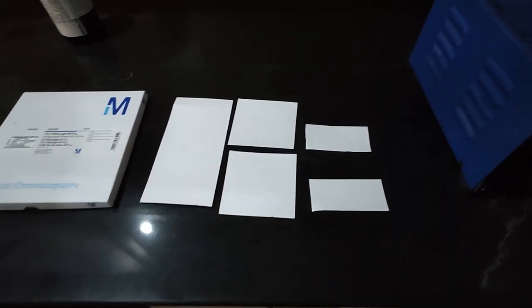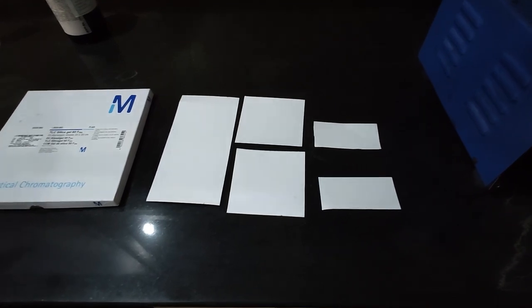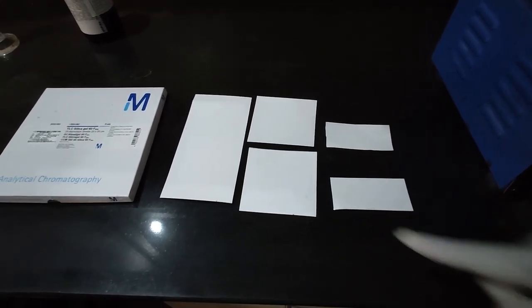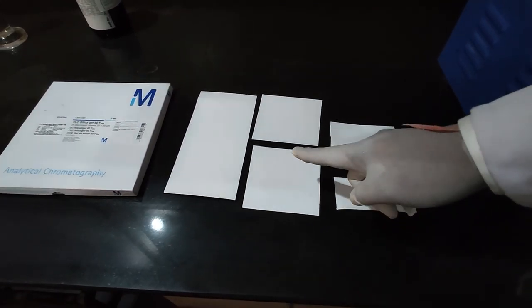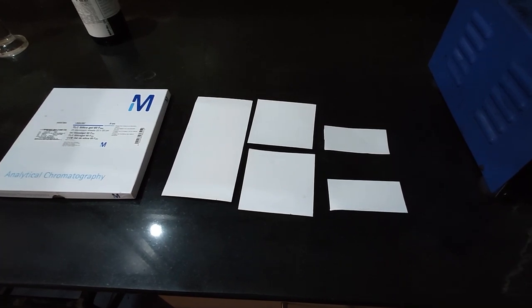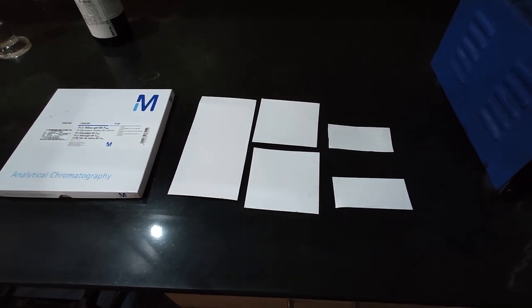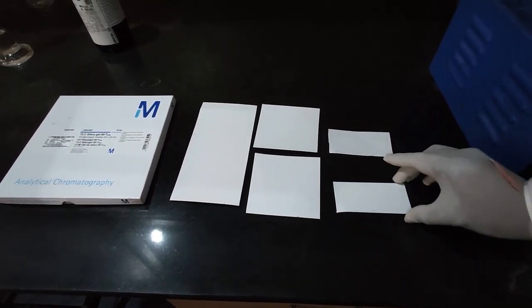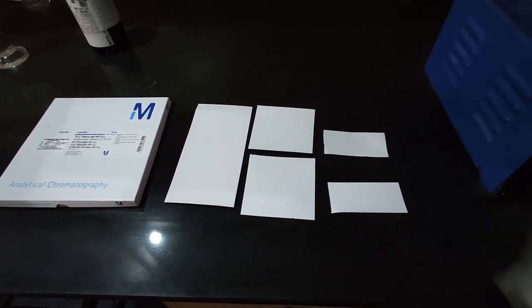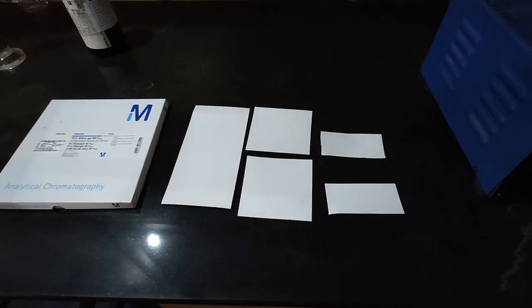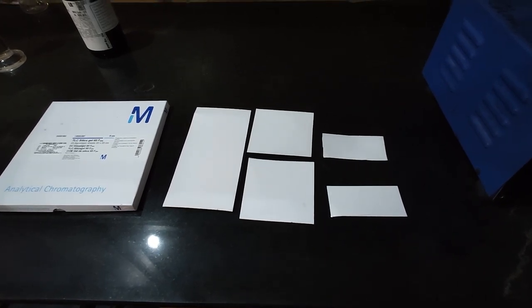In HPTLC, we use pre-coated plates. They are available with glass, aluminum, or polyester support. Plate size may vary with the sample numbers.